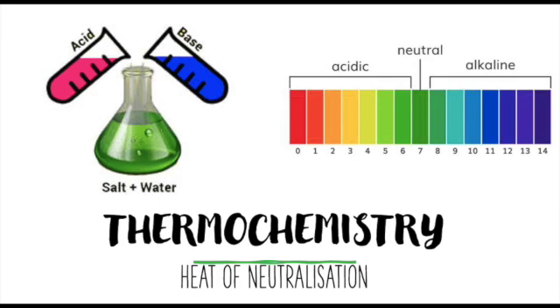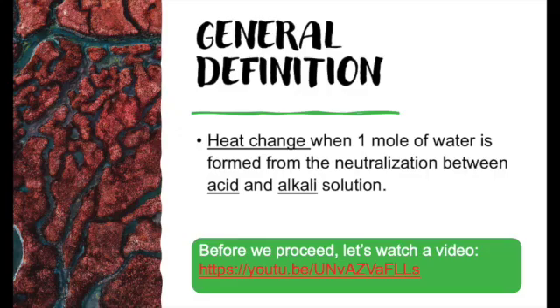Today we are going to do thermochemistry under heat of neutralization. What is the general definition for heat of neutralization? It is the heat change when 1 mole of water is formed from the neutralization between acid and alkali solution. Now before that, let's watch a movie.